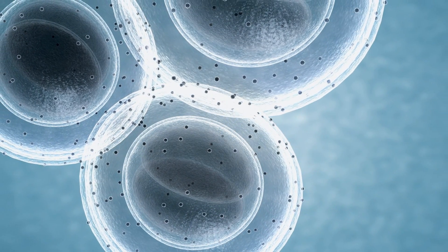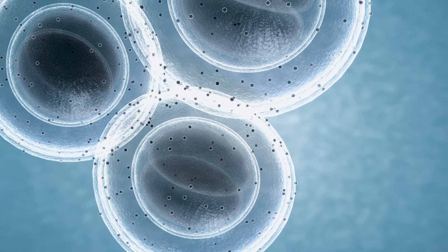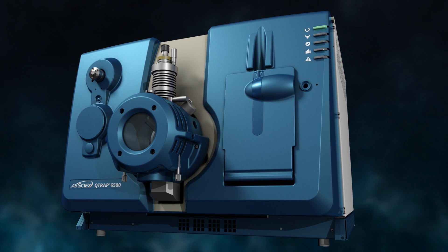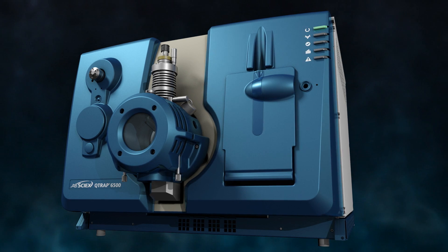AB SciX has been there from the very beginning, leading the advancements. Now, AB SciX has pushed the limits of performance again by merging highly evolved sensitivity with renowned performance.